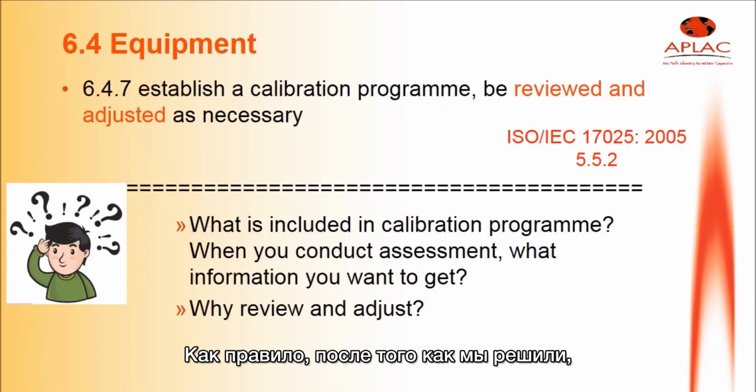Generally, when we decide that equipment should be calibrated, we should consider four factors.